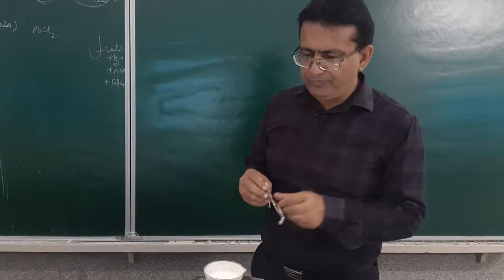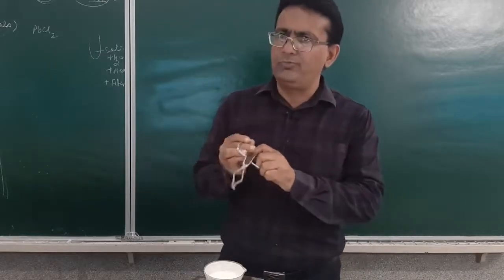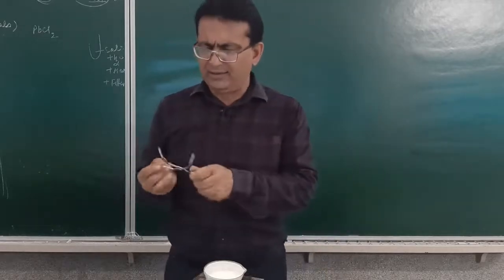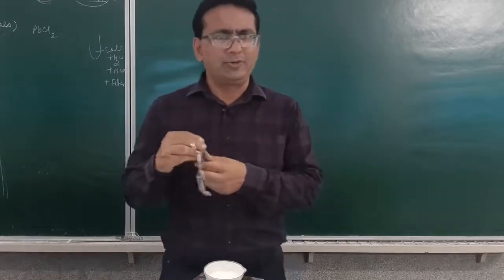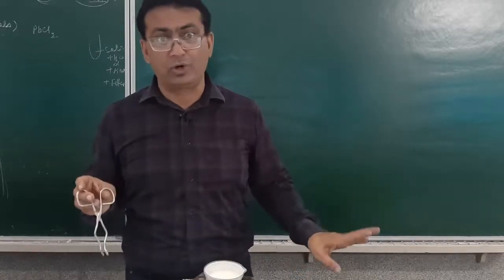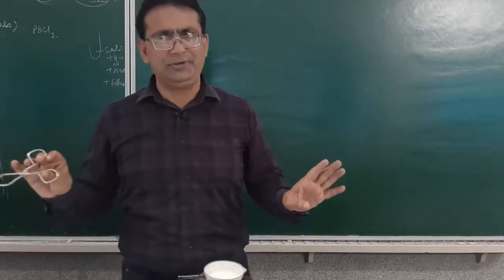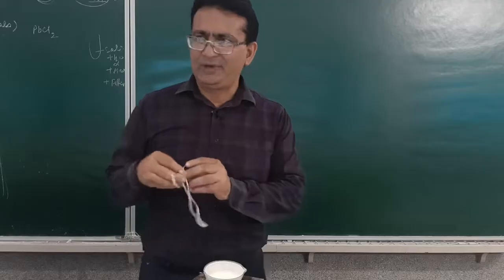Now what I will do, once it is heated up, is pick this up with the help of tongs. You have to hold it very tightly so that it does not spill. If it spills, it might spill on your hand or on a body part or on your clothes. If that happens, immediately tell me. You will be 100% safe. There is no problem. Fine?